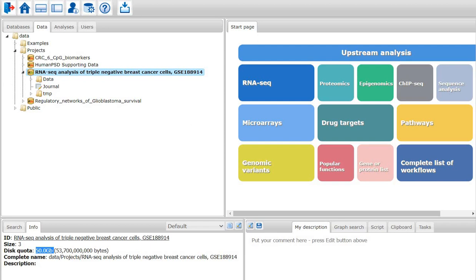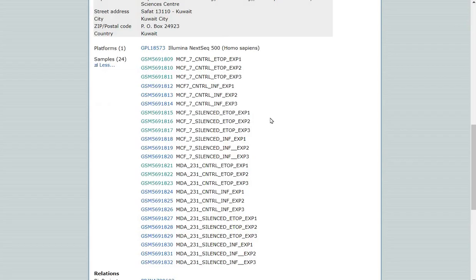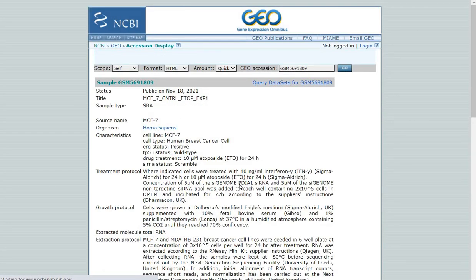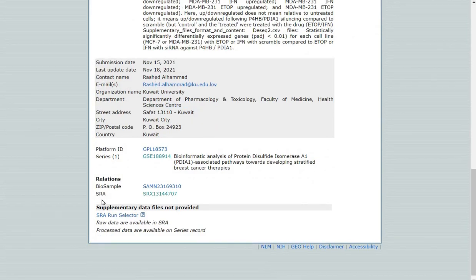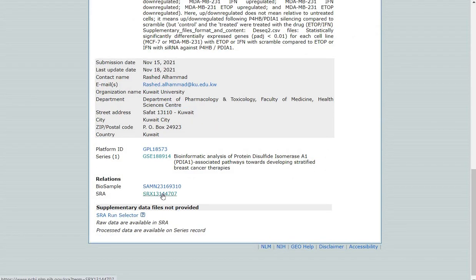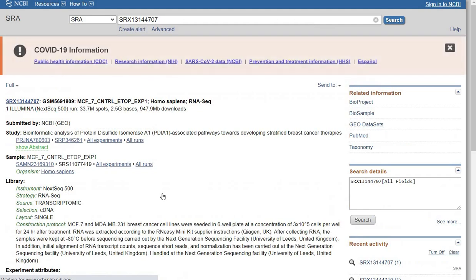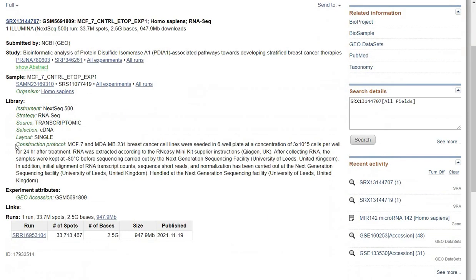To upload a FASTAQ file, I first click on the sample information given in GEO. Here I see the SRA number, and I click on this SRA number, which leads us to the SRA page for that particular sample. The complete information about the sample is visible here, and I can also see the layout. In this case, it is single layout, which means the experiment is performed with single reads.